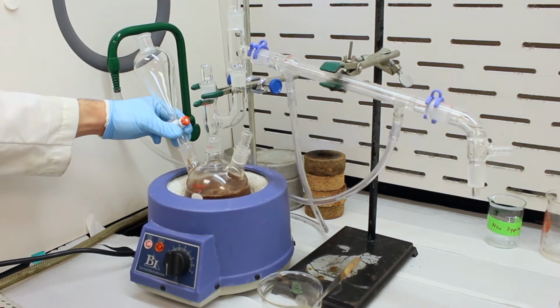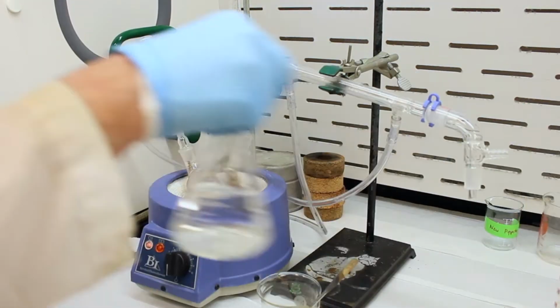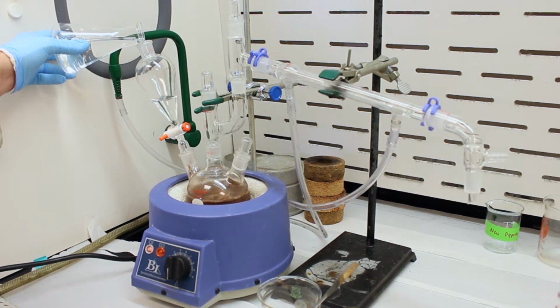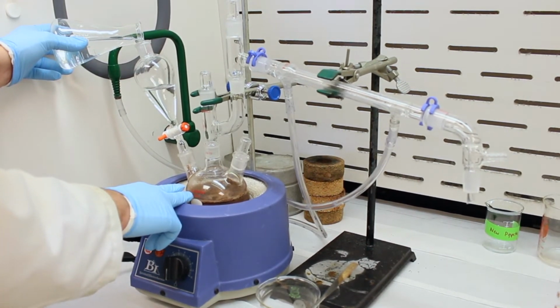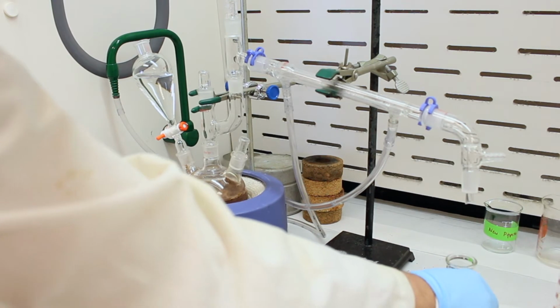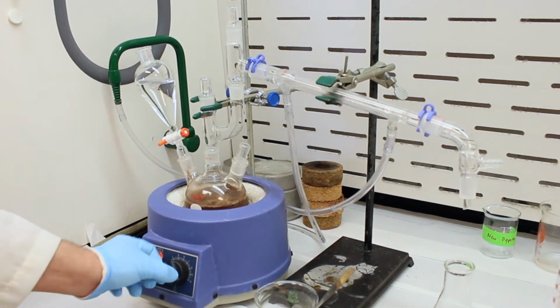The purpose here is not really to separate compounds, but as a way to add water to the reaction, or to the distillation as it's going. We want to keep the amount of water in here constant. So by dripping water, we can compensate for the amount of water that's lost through the distillation. So now that everything is assembled, we're good to go. And we can turn on the heat and wait for it to boil.